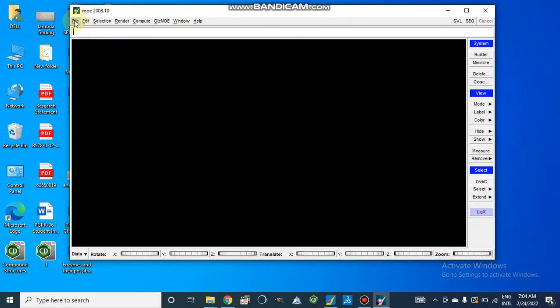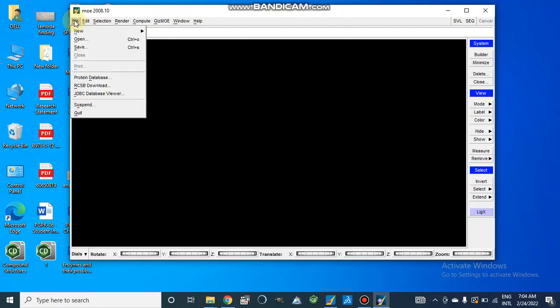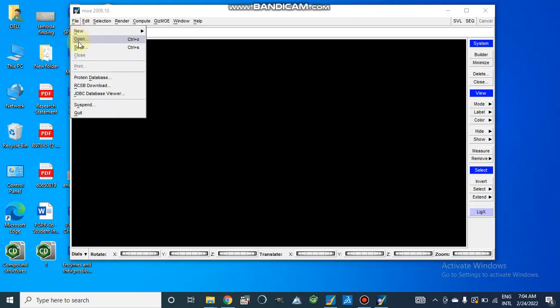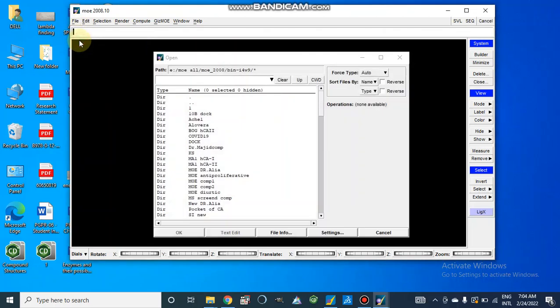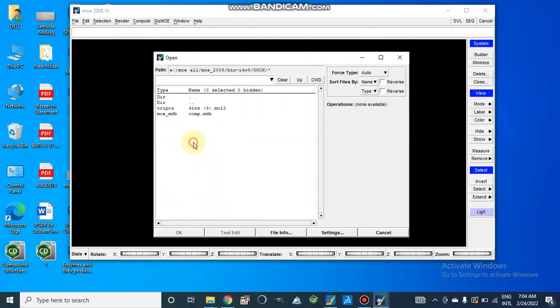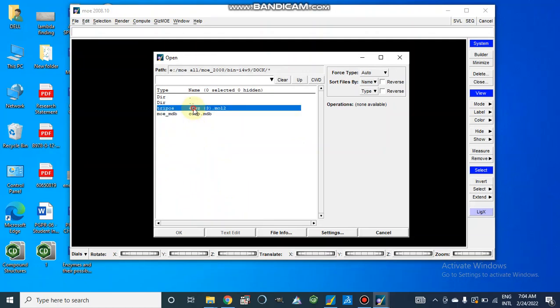First, we will study how we can find active site in 2008 variant, and then we will go to the 2019 variant. So first of all, go to file, open, and we have already retrieved our molecule in this folder that is doc. Here we have our enzyme or the target protein which is present.